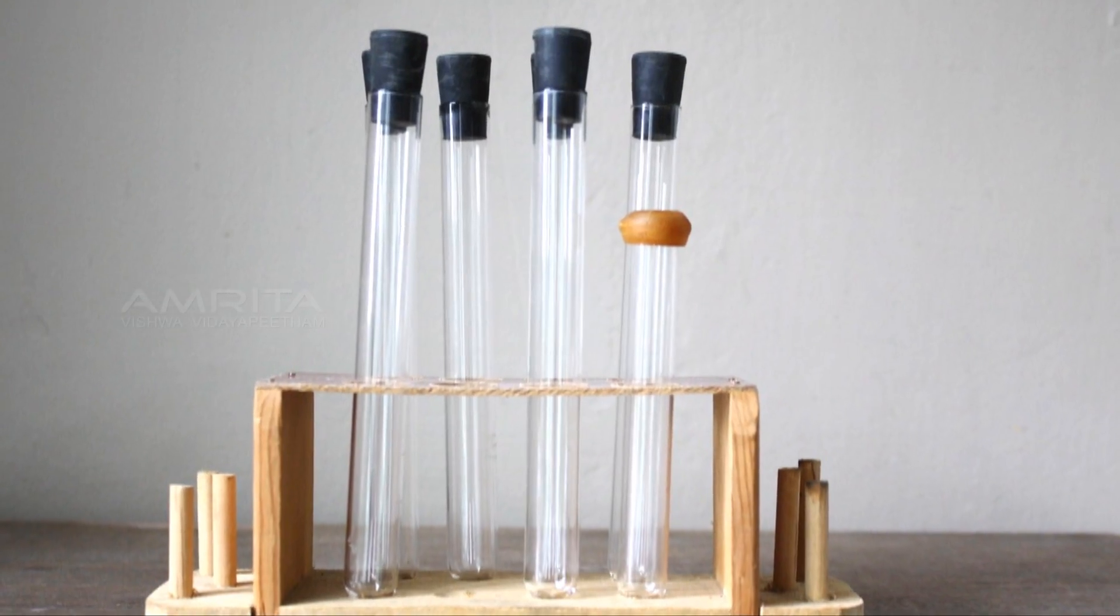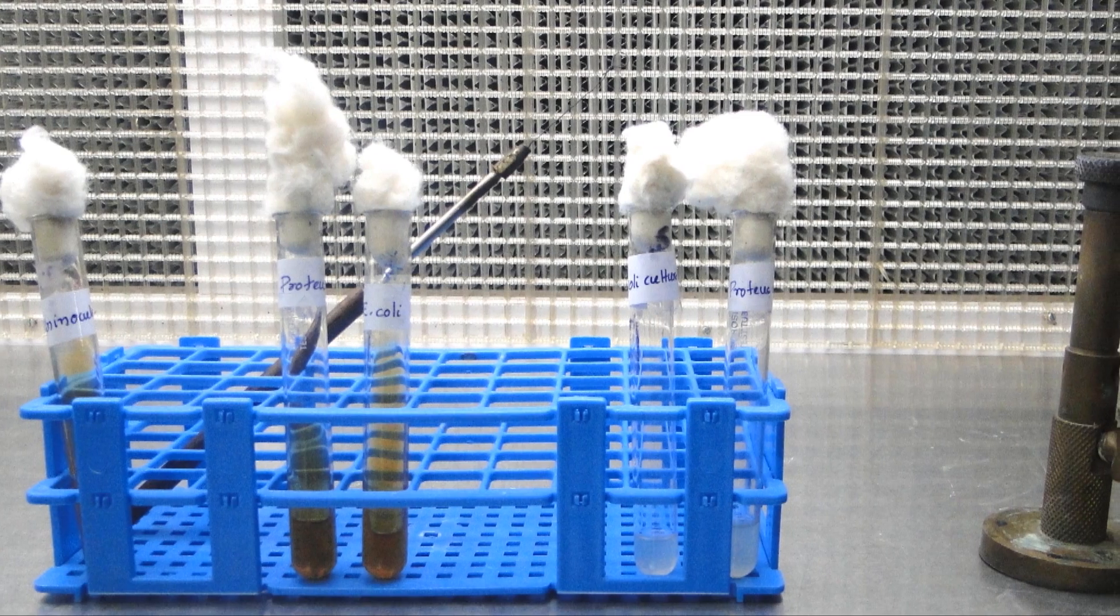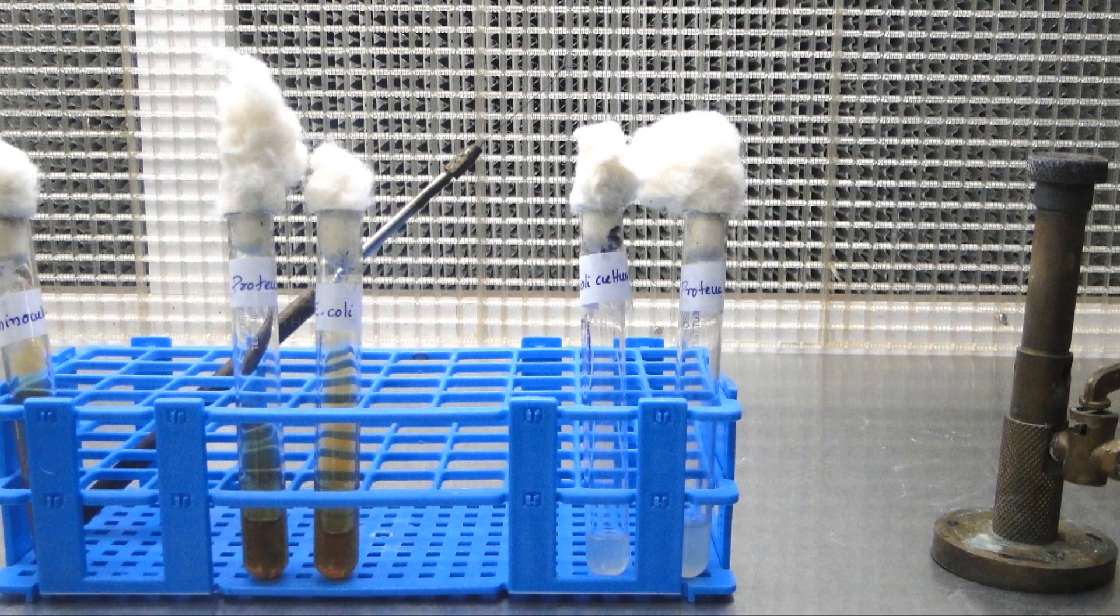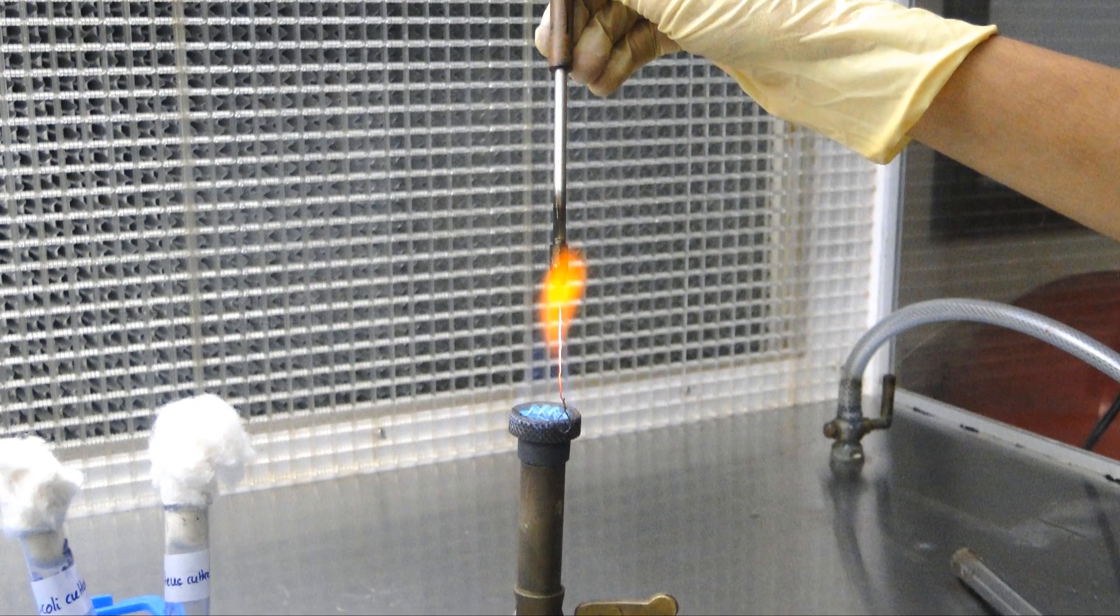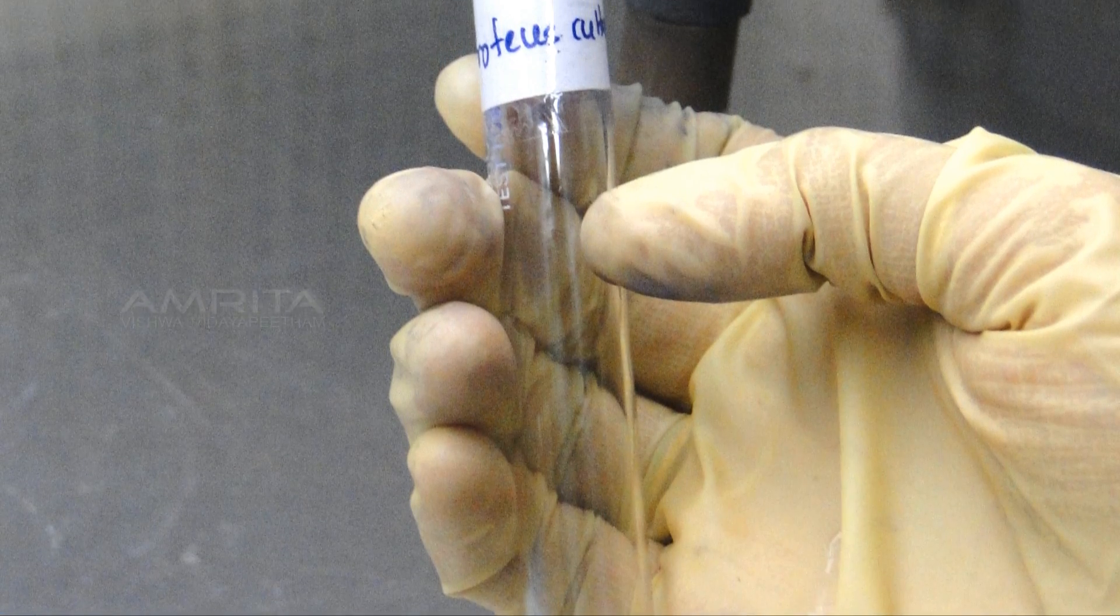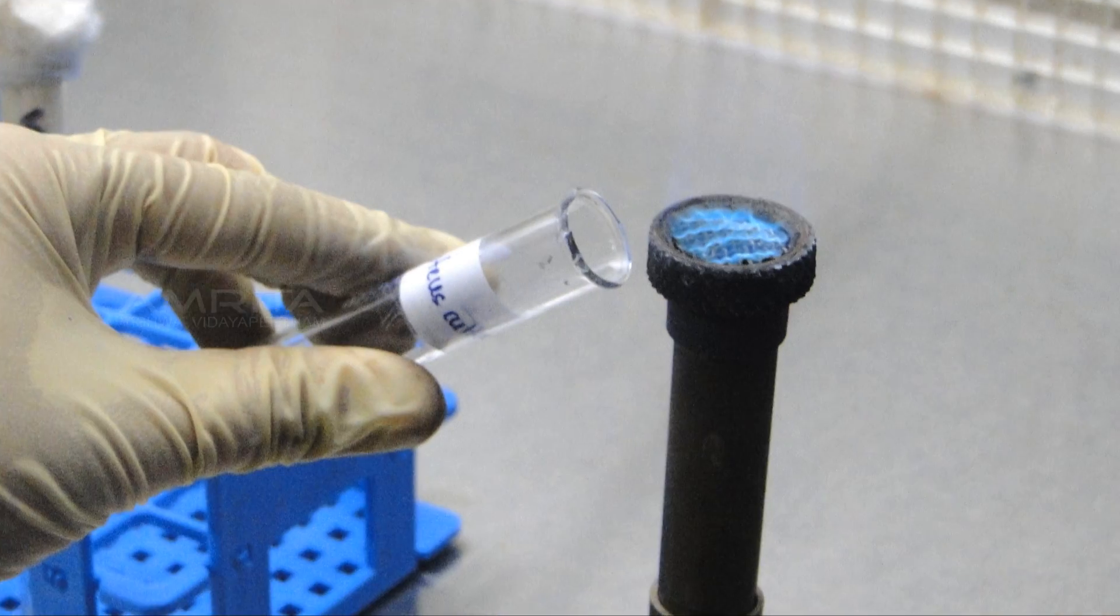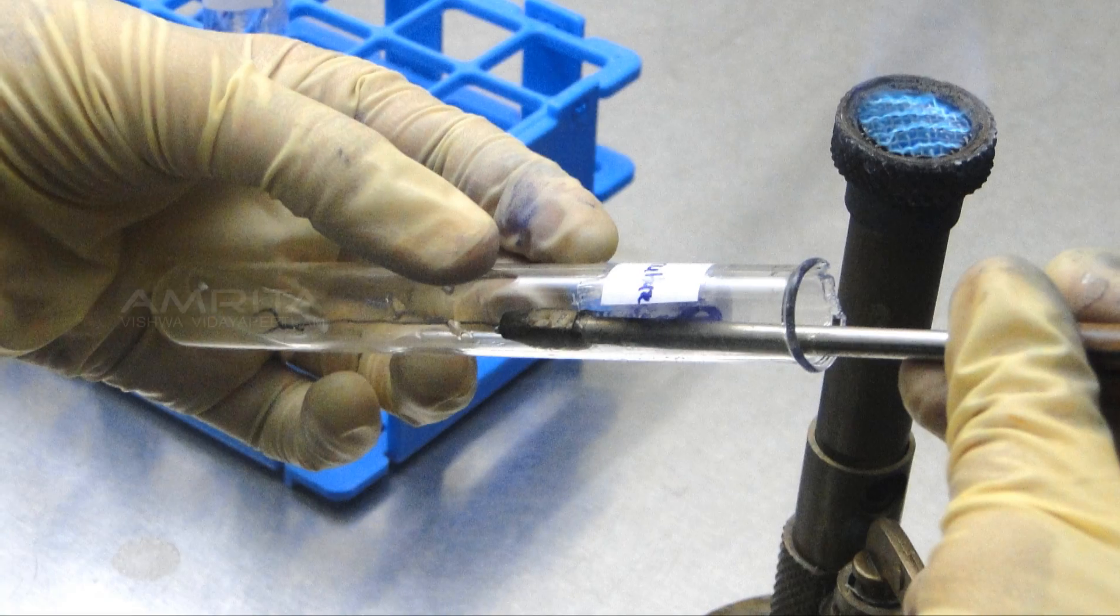Procedure: Arrange the materials required for the test on laminar airflow. Sterilize the inoculating loop in the blue flame of the Bunsen burner until red hot, then allow to cool. Take the tryptic soy broth tube from the rack containing 24-hour culture, gently tap it, remove the cap, and flame the neck of the tube.